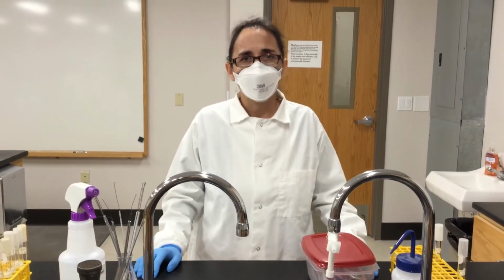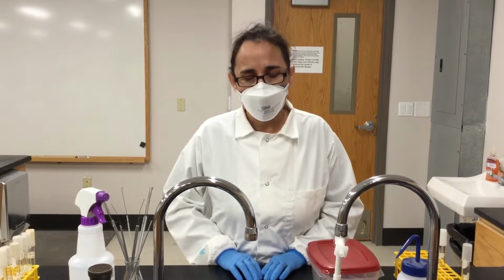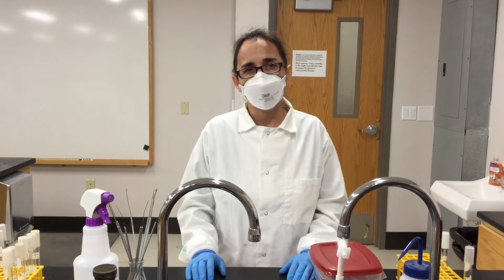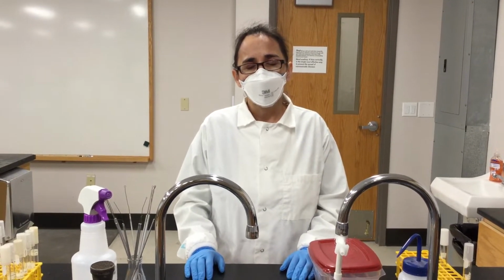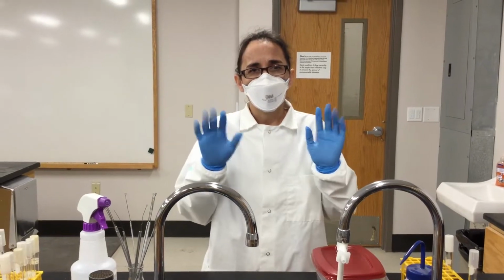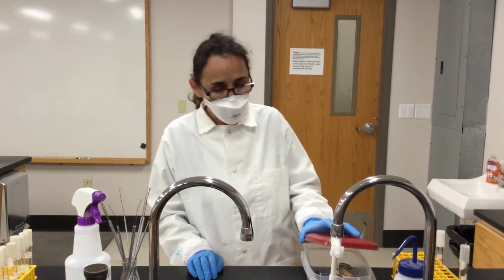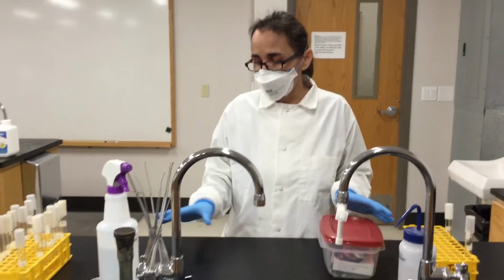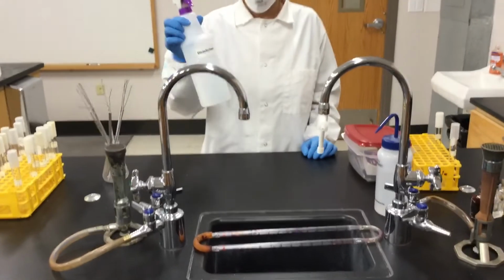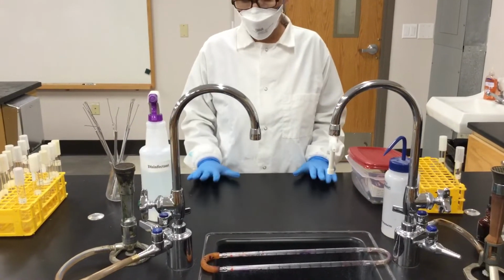So in this video we're going to see some of the techniques for staining. Before staining, you need to wear your personal protective equipment, or PPE, which includes wearing your lab coat, gloves, and your glasses if you wear them. And then you have to clean your working area with this disinfectant and with paper towels.